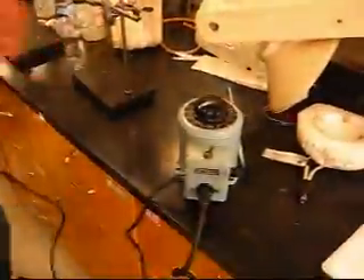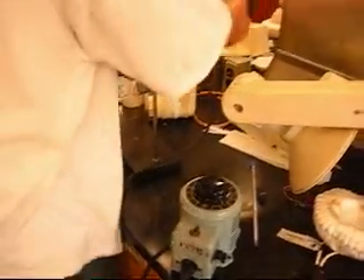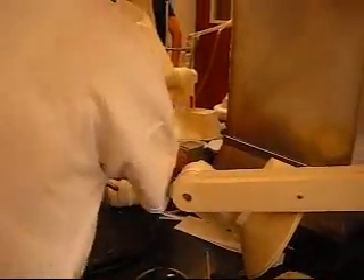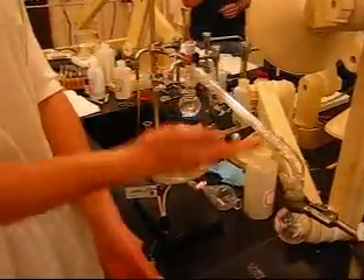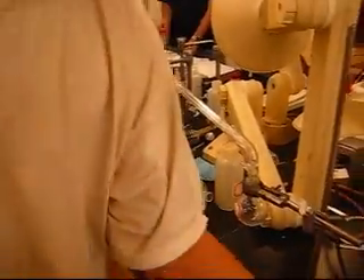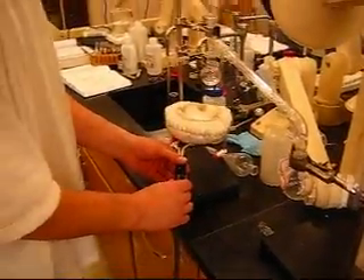Now we're going to set up our heater. We're going to use this device right here. It's really simple — it plugs into a wall. This is going to actually heat the flask, which is going to sit right here, so it warms up so that it distills. To do that, we need to connect it to a power source — this is our power source, sort of.